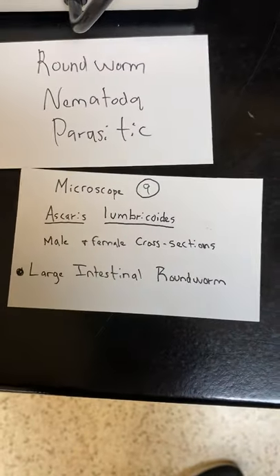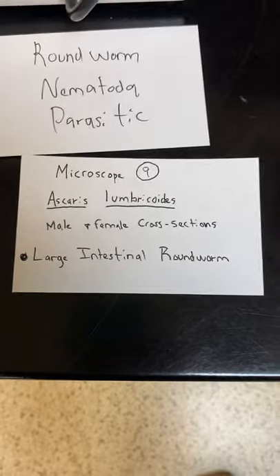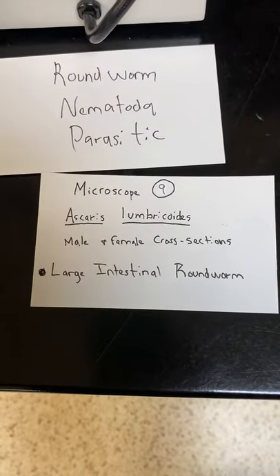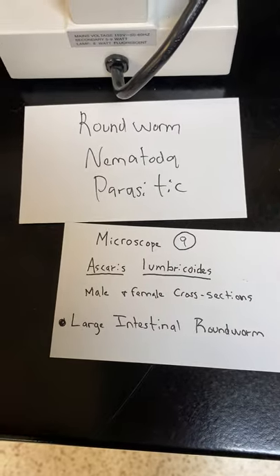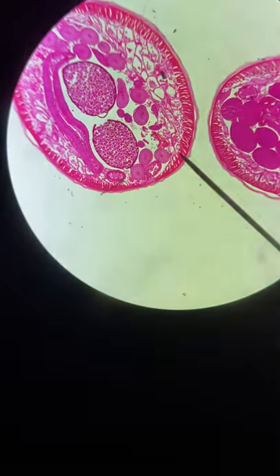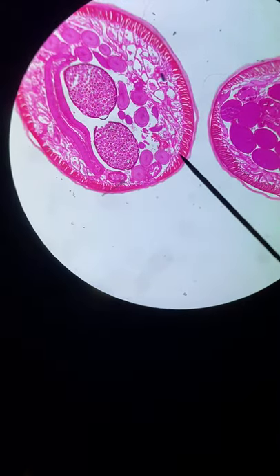Microscope nine: this is Ascaris lumbricoides, the large intestinal roundworm. This is a cross section, so we're looking through the body — there are two of them, a male and a female. It's a roundworm, Nematoda, and parasitic. These are cross sections of the worm.